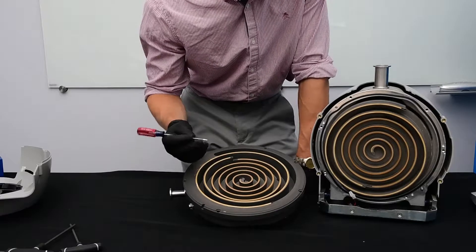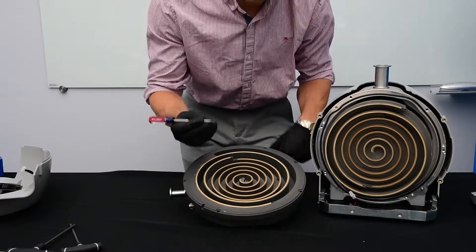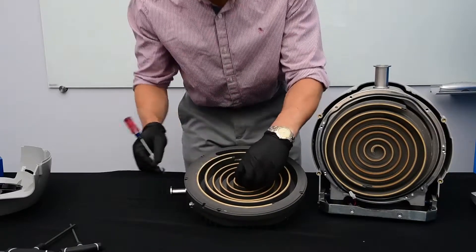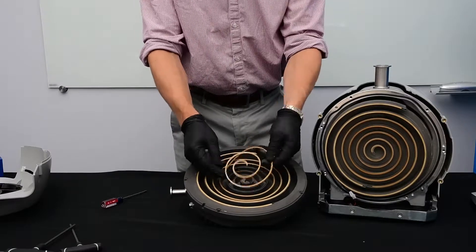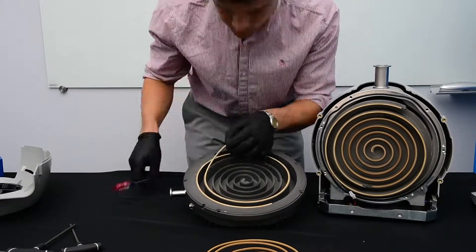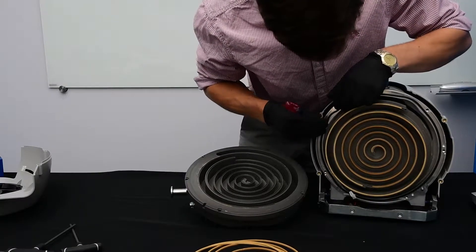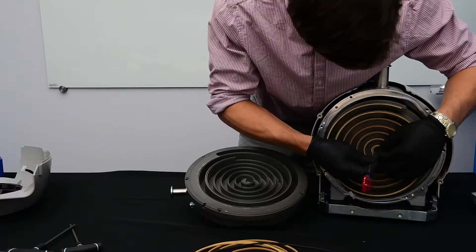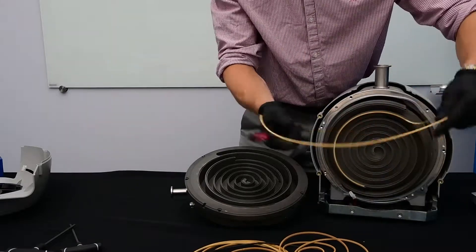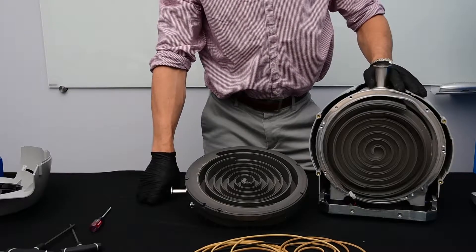Now I'm going to use a small screwdriver to remove the tip seal. This is an anodized metal surface so you have to be very careful not to scratch it if you use a metal pick or screwdriver. We can discard both the o-ring and tip seal as we will replace them both with a new tip seal and o-ring in our kit.